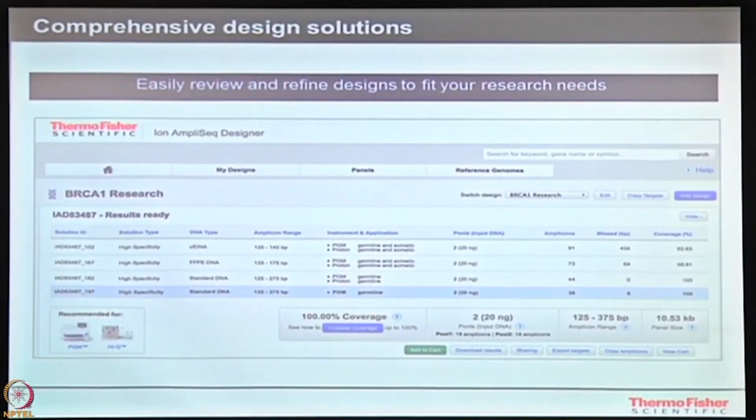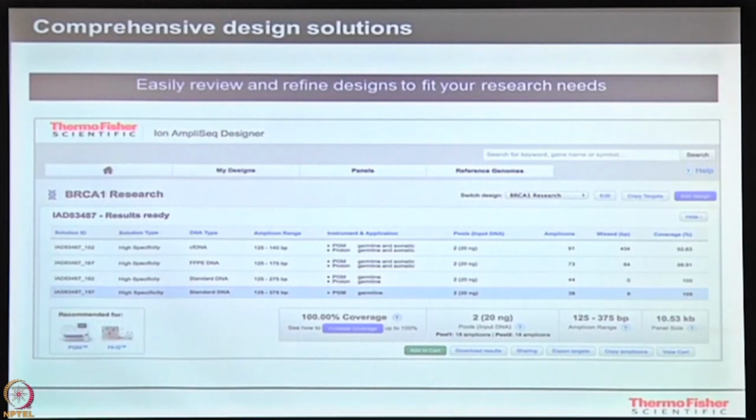You can get primers designed based on different types of samples. Okay. Now, you must be studying blood types of samples. Normally what your lab test does is, you take the blood samples, you take all the genomic data out of it, target your particular gene and then do the studies further, right? So such analysis could be done. We can get a design ready for it, and in that I get to know how many amplicons are getting designed for a particular gene. Now for my BRCA1, I think the design looks like you have 36 amplicons that have been designed just for your DNA sample. Okay.